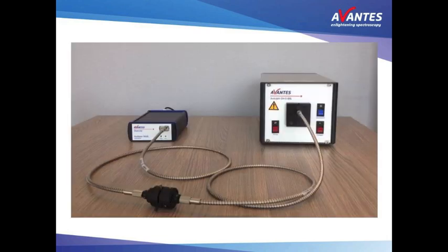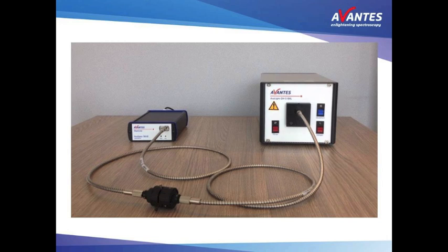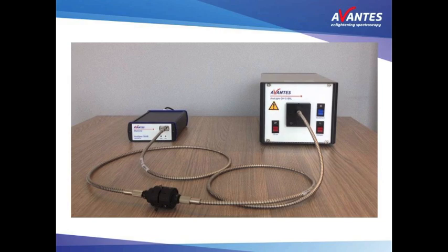We will demonstrate it with the following transmission setup, consisting of an Avantes spectrometer, a light source, an attenuator to simulate changing transmission properties, and fibers to connect everything together.